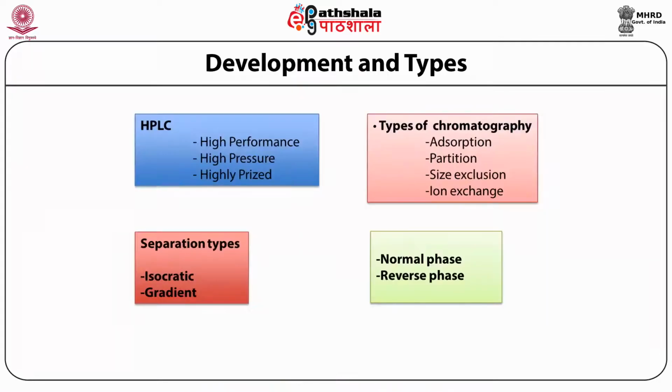Different types of HPLC are being used. When we try to categorize them for our understanding, HPLC itself can be defined as high performance, high pressure, or highly priced liquid chromatography. Any one will fit for this P. But when you get inside the machine, we need to understand that separation in chromatography is based upon a few fundamental rules.